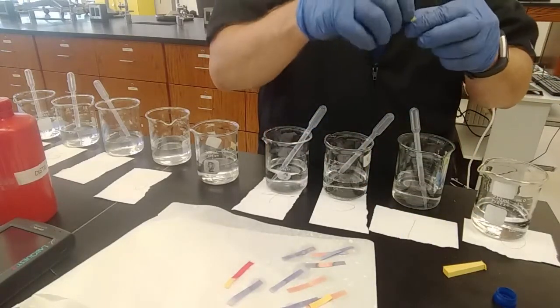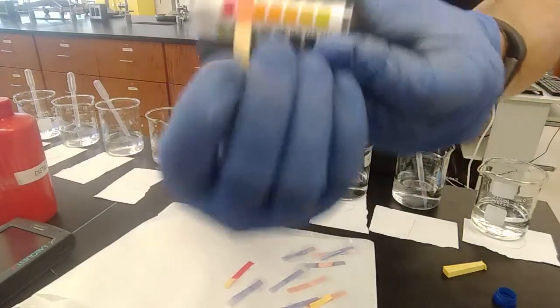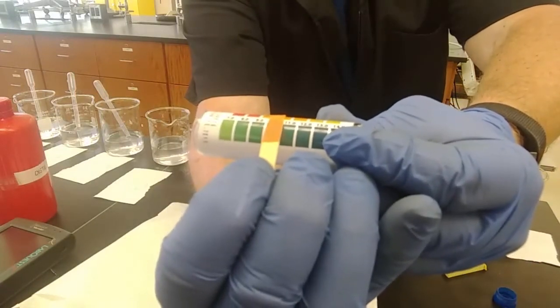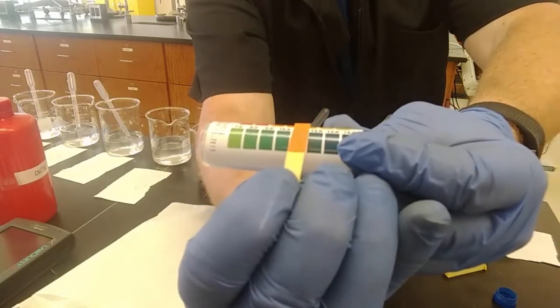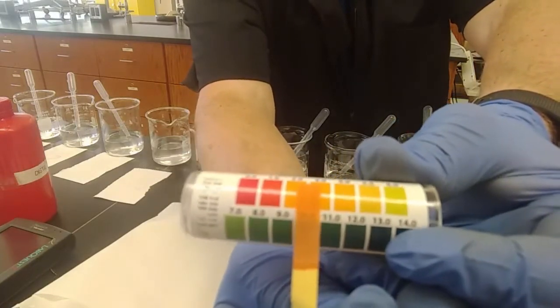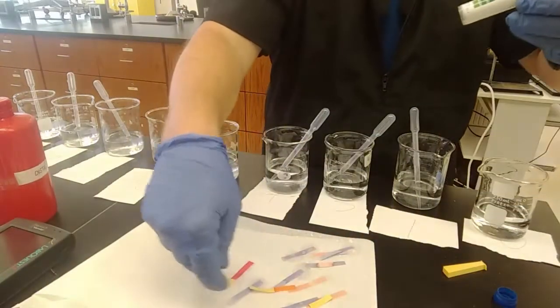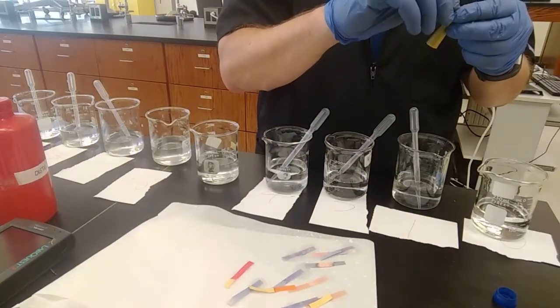Let's try our expected pH 1. Definitely not red, definitely more orange. To me, it looks like it's somewhere in between 2 and 3. You can decide for yourself, but I'd call that a 2.5. All right. Expecting a 1. Got a 2.5.